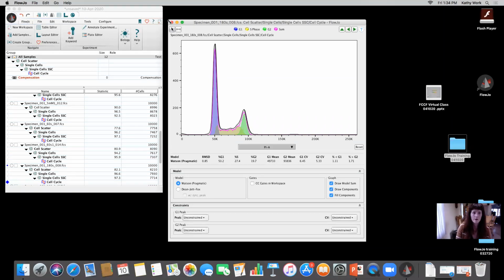Proliferation. Right. Let me just ask you a question, because a few people here have brought this up. You went immediately from a simple data set, and some people are asking, should we address quality control of the sample, like looking at the time gate? Do we need FMO controls and compensation? And even, do we need to gate out the dead cells? The typical things we do with immunophenotyping. So I have a couple of suggestions there.